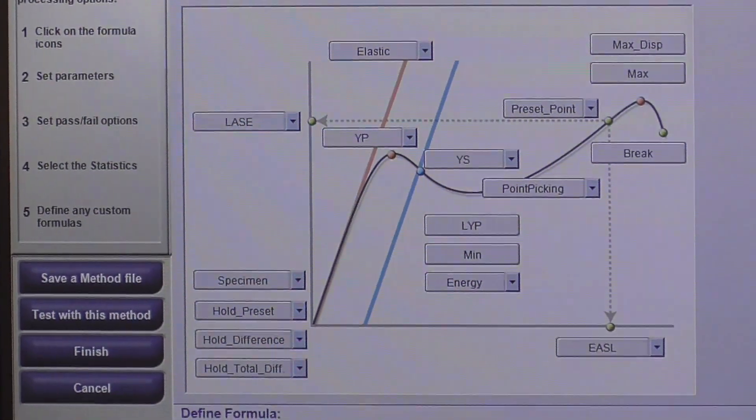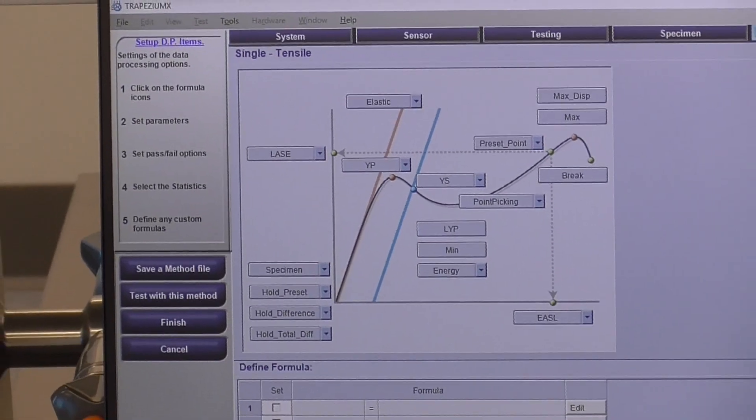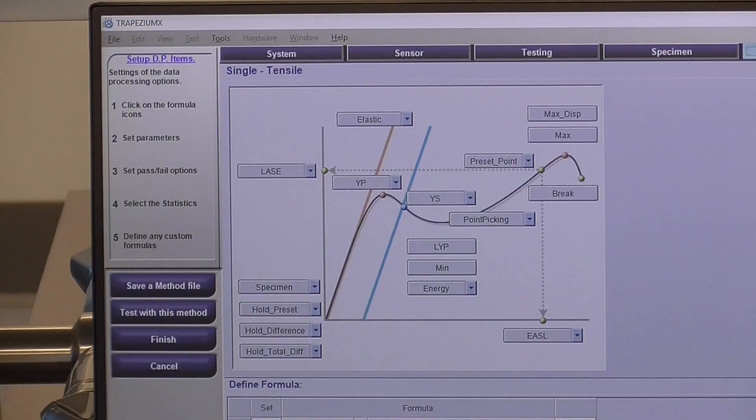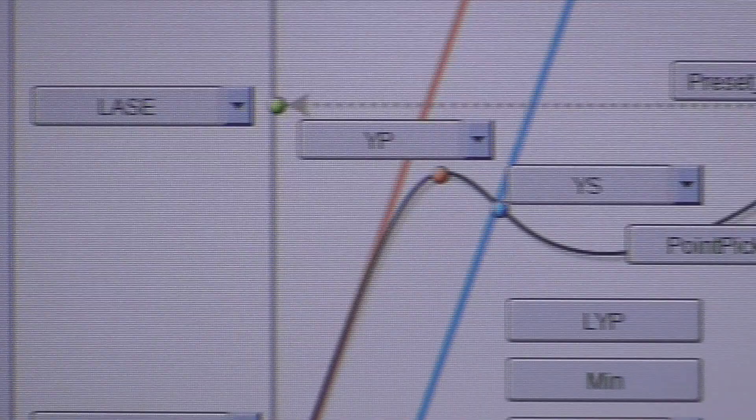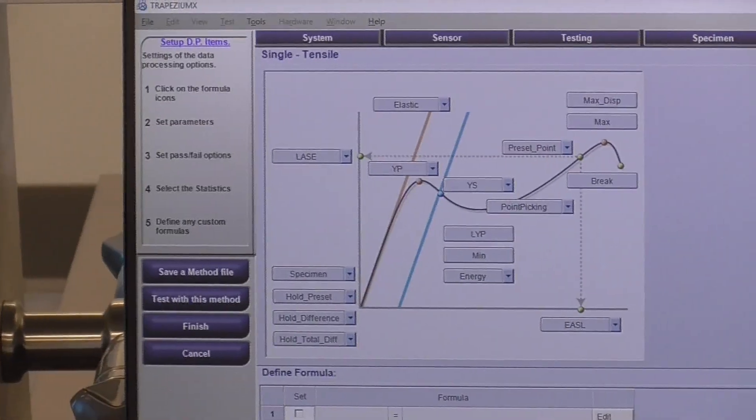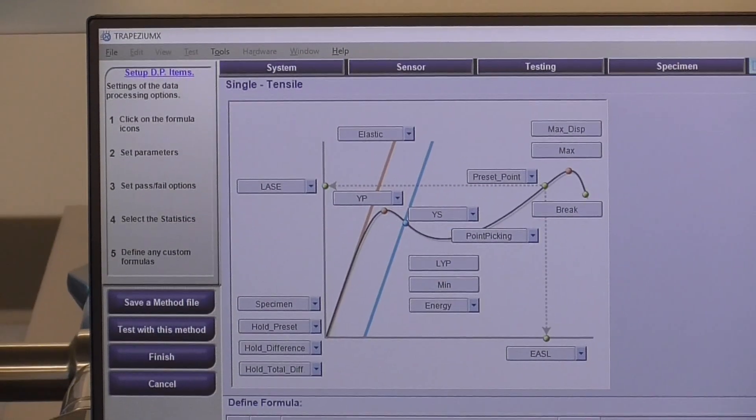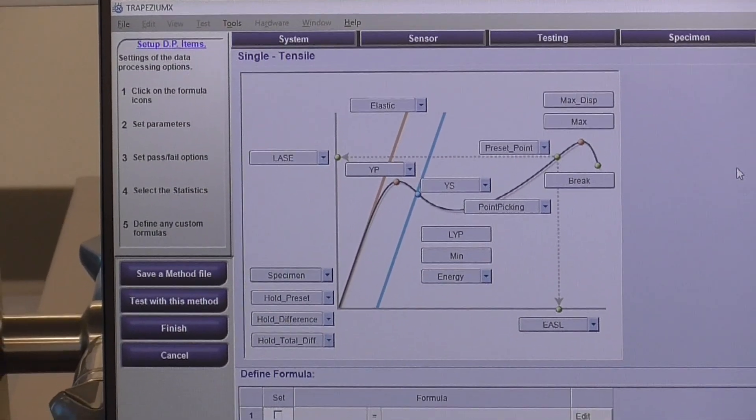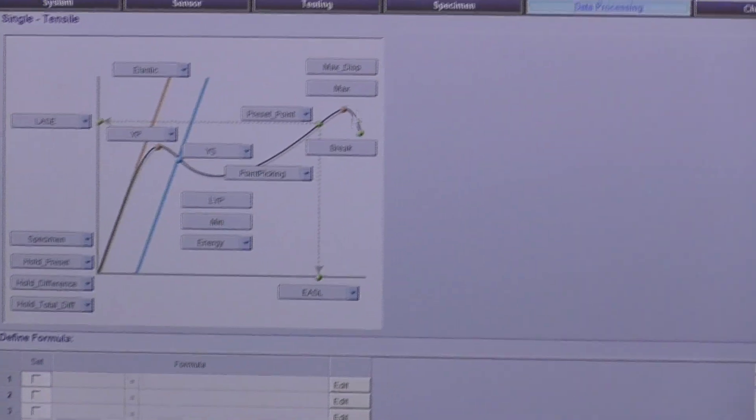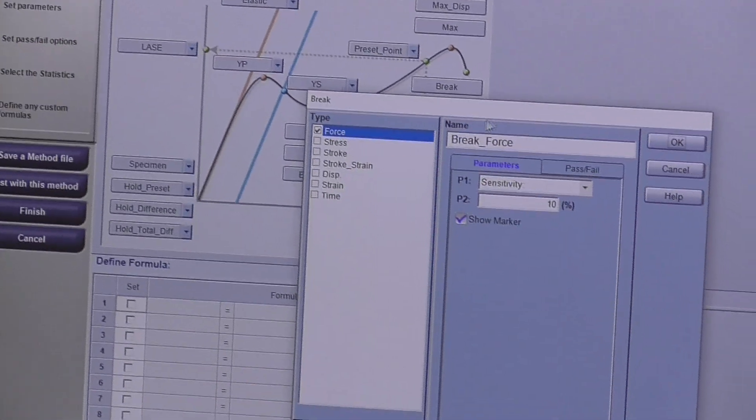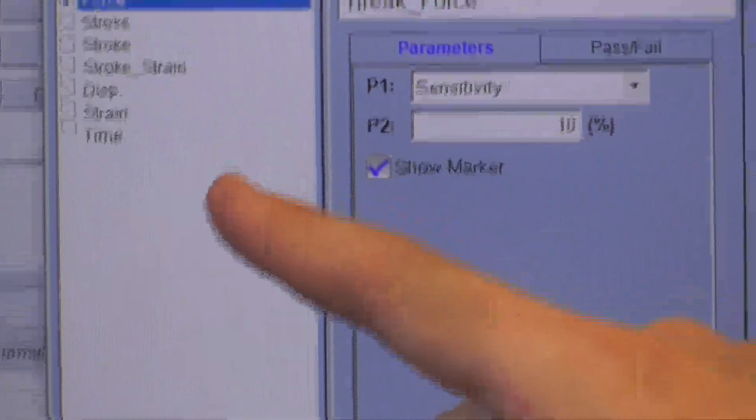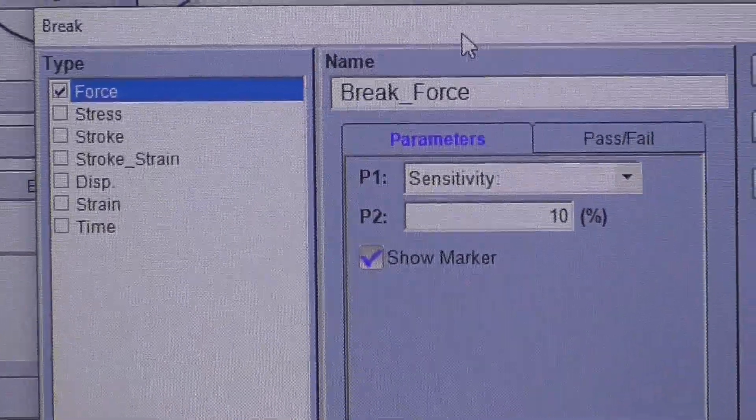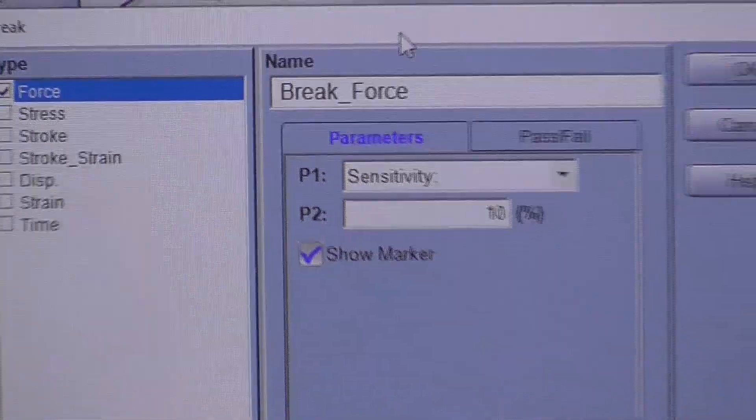Alright, data process. So here's where you actually pick the data points that you're pulling off the test as you're testing it. You can spend a lot of time in here. Similar to how you can pull up the help feature specific to the window that you're in, handy here is where you can pull up the help feature specific to the data processing parameter that you're in. So just for easiness sake, let's take break. So we'll click break. And right now it's selected at break force, but we can select any data processing parameter at that break point. So we can get break stress, break stroke, the displacement of break, things of that nature. And to select those, we just need to check these little check boxes.